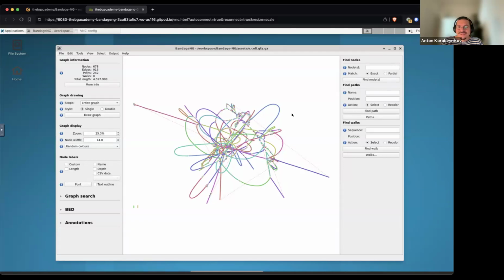That's probably the outcome of the VNC session. Sorry. But anyway, you can see that we have a couple of dead ends here, but we have scaffolds that connect these dead ends with the probable scaffold parts. We could click on the nodes and see what's going on. You can click on the edges and paths, so you can see that it's indeed the jump link.